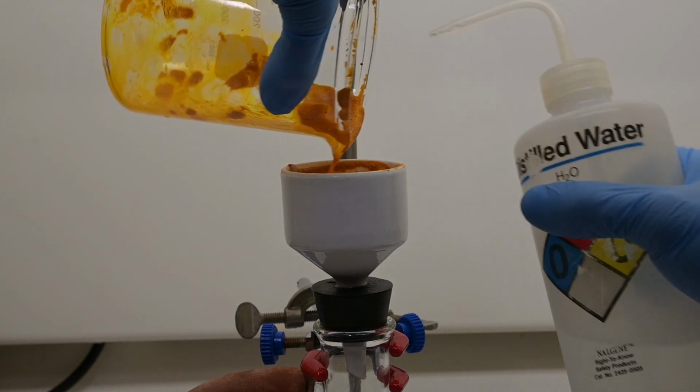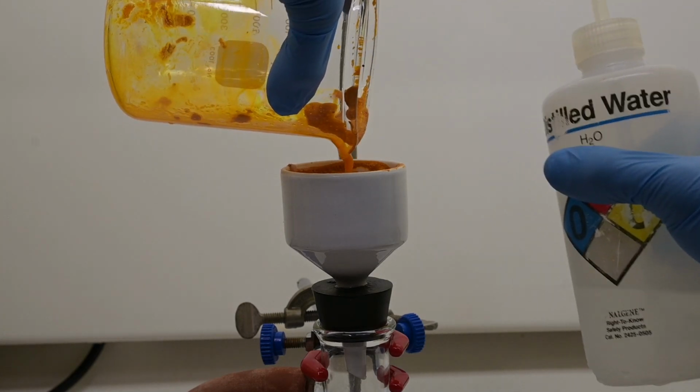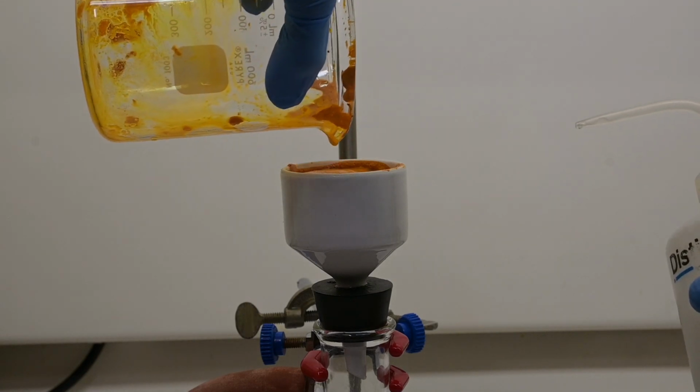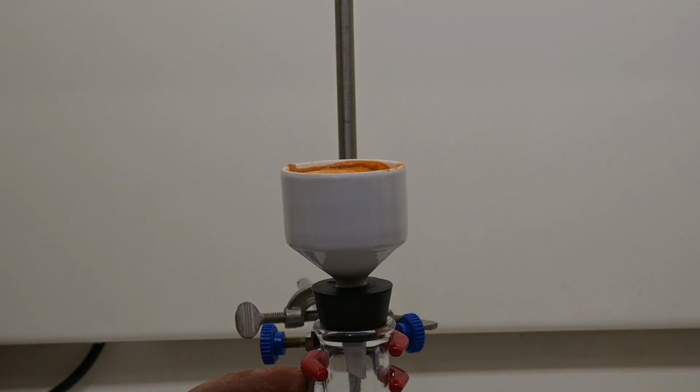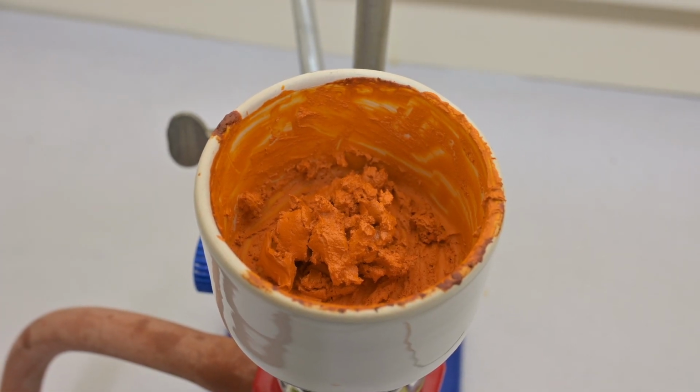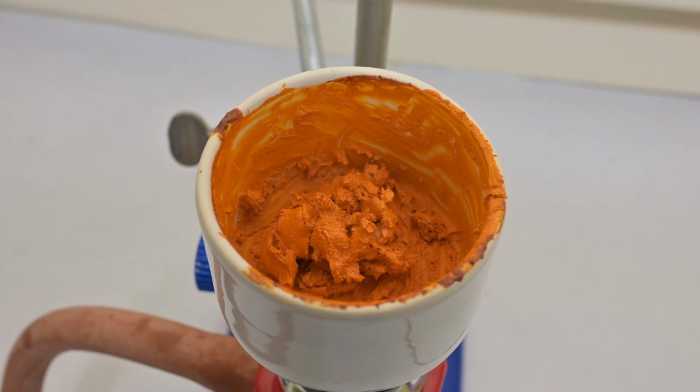We then collect the precipitate with suction using a Buchner funnel and filter paper, and using a bit of ice-cold water to wash out the beaker into the funnel. After filtering for a while, we are left with a nice orange mass. Right now, our methyl orange has impurities in the form of unreacted compounds, sodium hydroxide, and other junk. To get rid of this, we need to do a recrystallization.